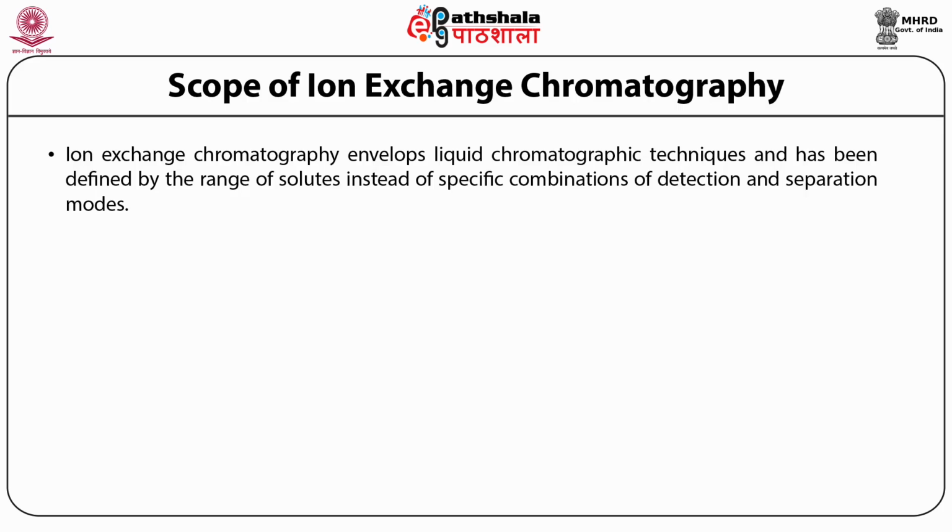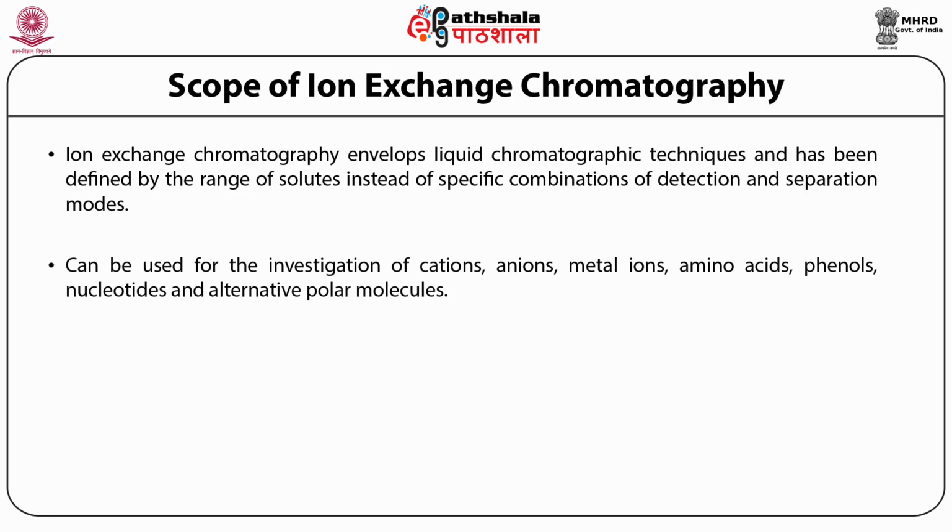The development of IEC is prompt as it provides a reliable and authentic method for the investigation of cations, anions, metal ions, amino acids, phenols, nucleotides, and alternative polar molecules.